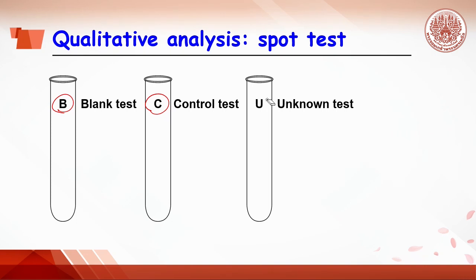The last test tube labeled with U meaning unknown ion. The unknown sample will be added if it reacts with the same reagent with control. The positive or negative test will be shown depending on what ions in the unknown.